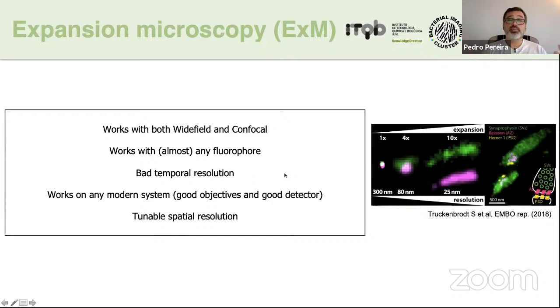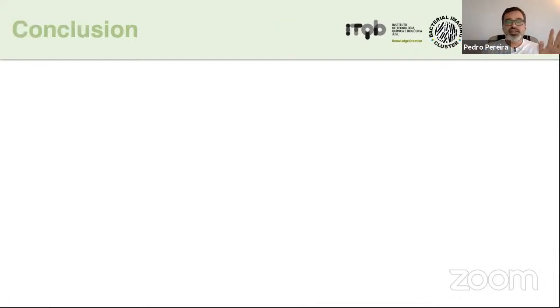And if you go to the original papers, there are lists of dyes and how well they withstand the treatment. Obviously, it has very bad temporal resolution because you cannot do this in live cells. It works with any modern system, and again, it also has tunable spatial resolution because you can choose which technique to use, okay? So I'll finish here.